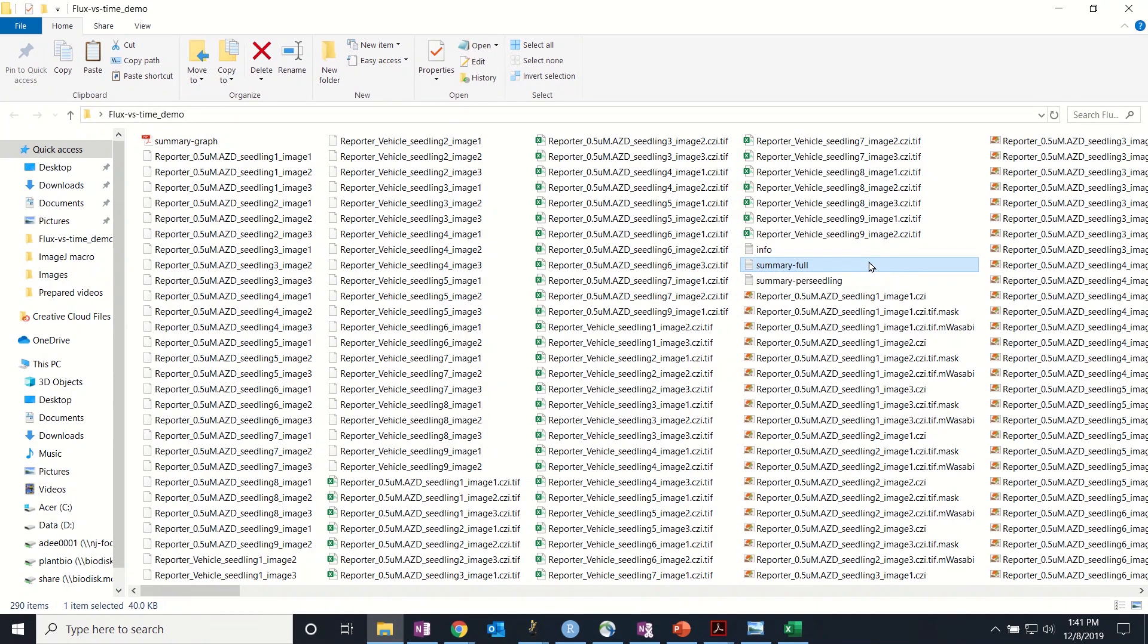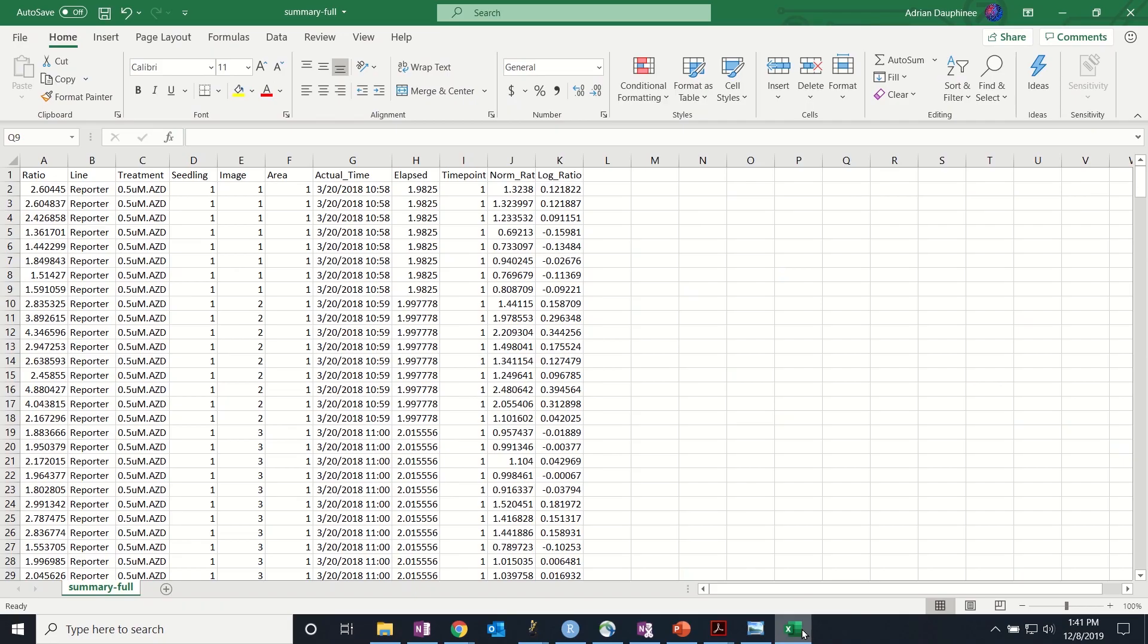If we take a look at the full summary file in Excel, you'll see that all the data is organized neatly.